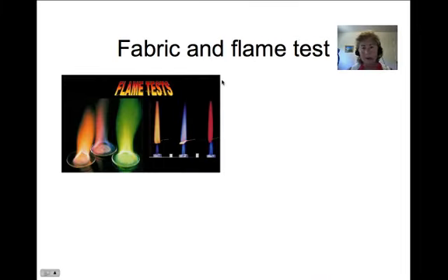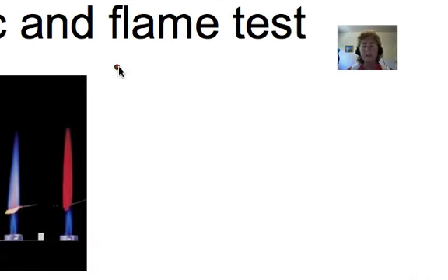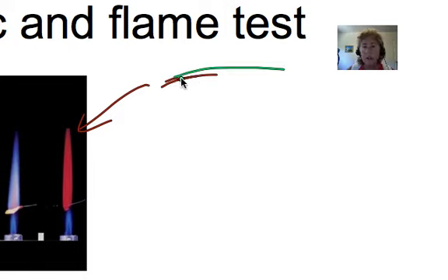We're also going to do a fabric test. Definitely your goggles. I don't want you to blow the school up or anything like that. Very basic. There were a few pieces of fabric found. And the fabric is going to be placed just above the flame, not into the flame, not so far away that the flame can't even react with it. And you're going to test each fabric. You're going to hold each little piece of fabric with wonderful, fascinating things called tweezers. Okay, you all know what these are.